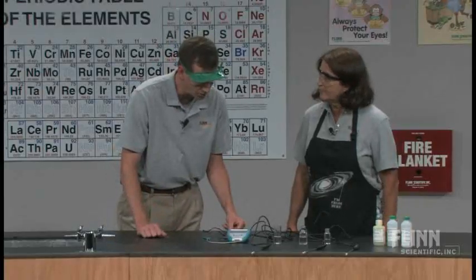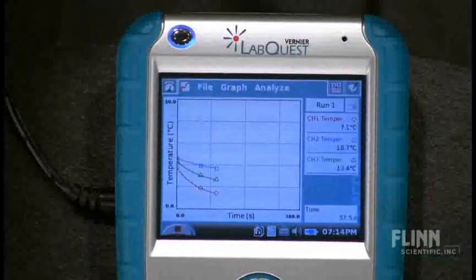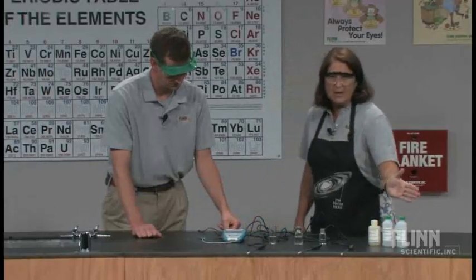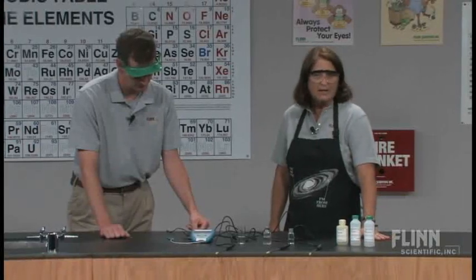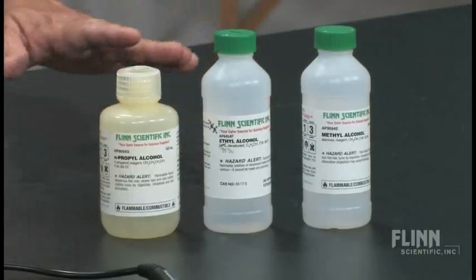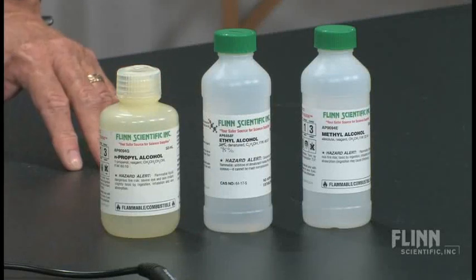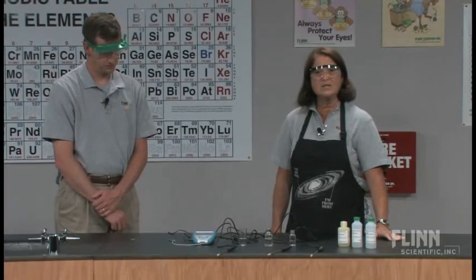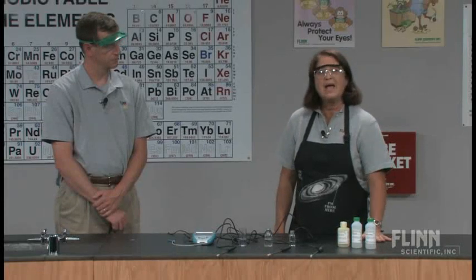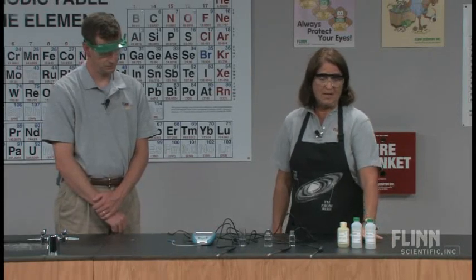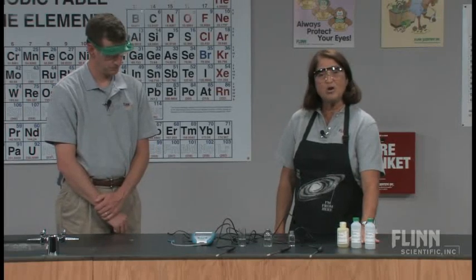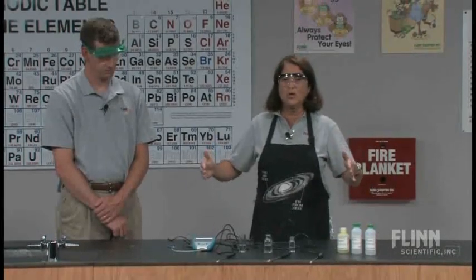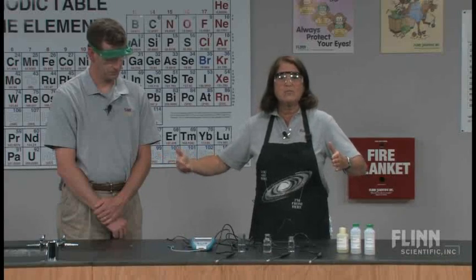It appears that they're not all cooling off at the same rate — and there's got to be a reason for that. In this experiment we're using three different alcohols. They're all alcohols, so they all contain the same functional group: an OH group. The stem of these alcohols is what varies — methyl alcohol has a one-carbon chain, ethyl alcohol two carbons, propyl alcohol three carbons. So we're simply lengthening the carbon chain, making the molecule larger, and at the end of the chain is a hydroxyl group.